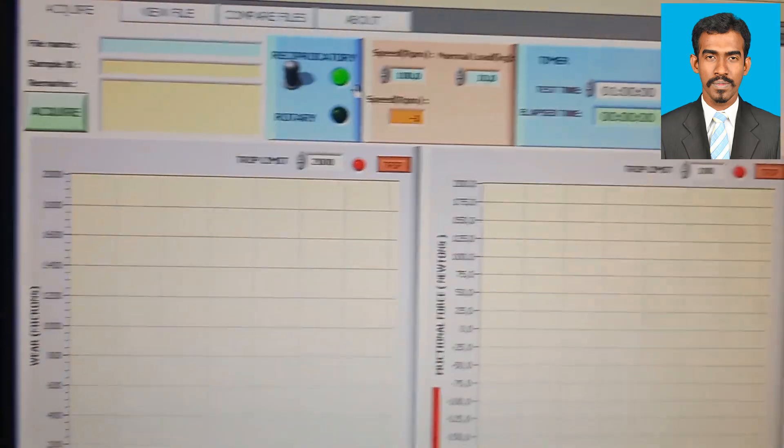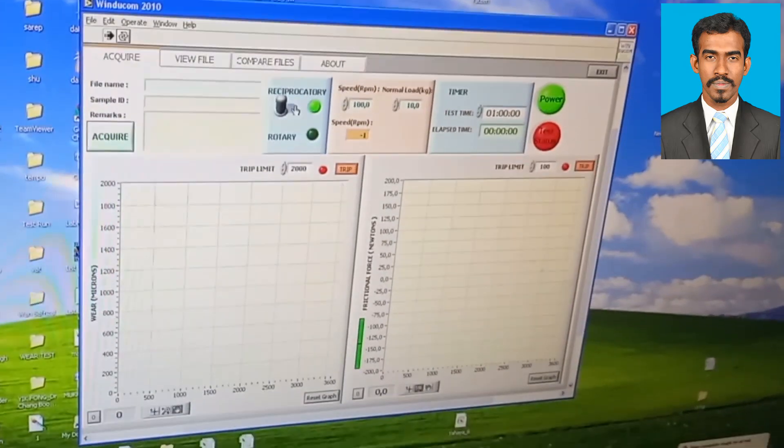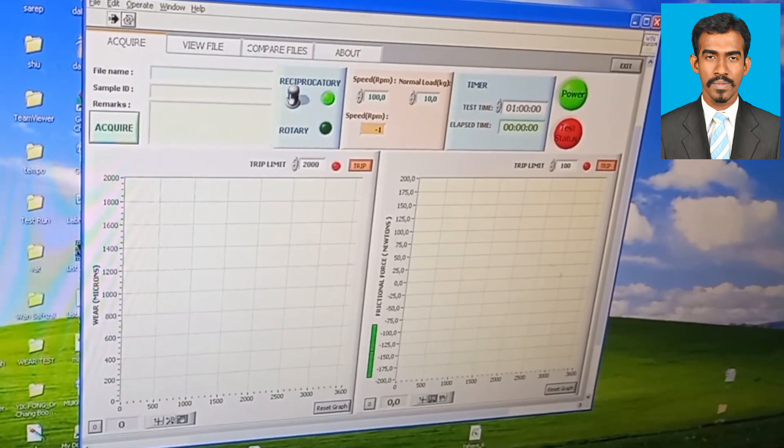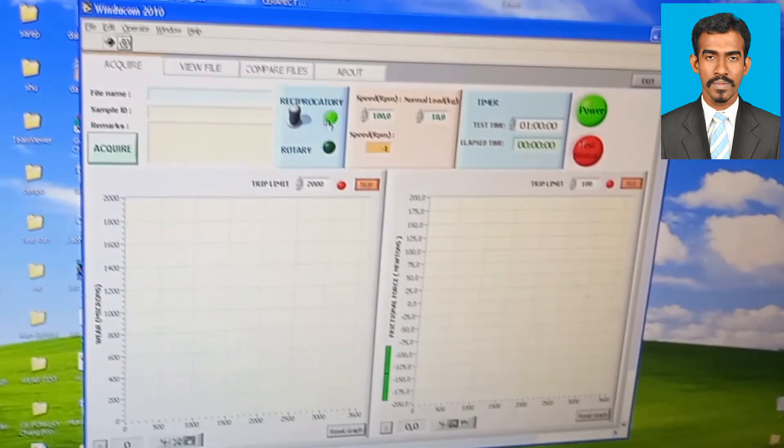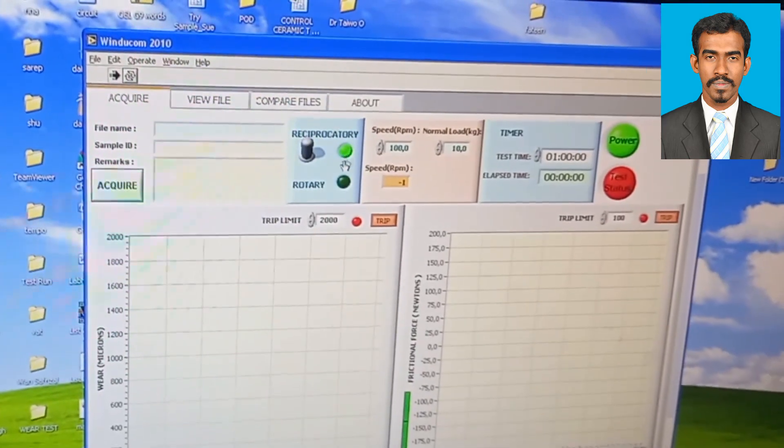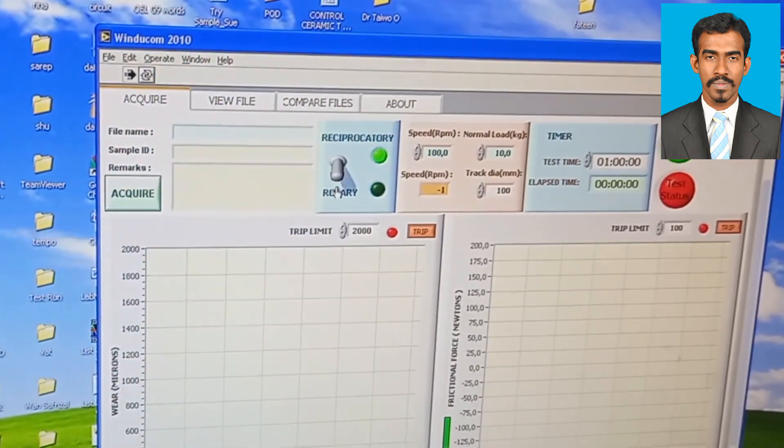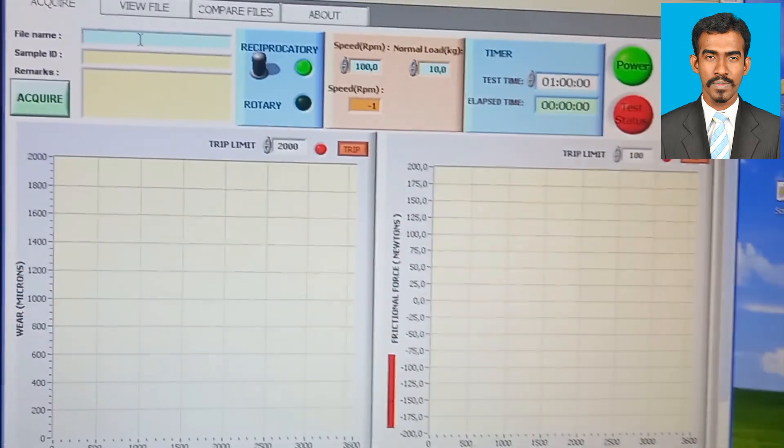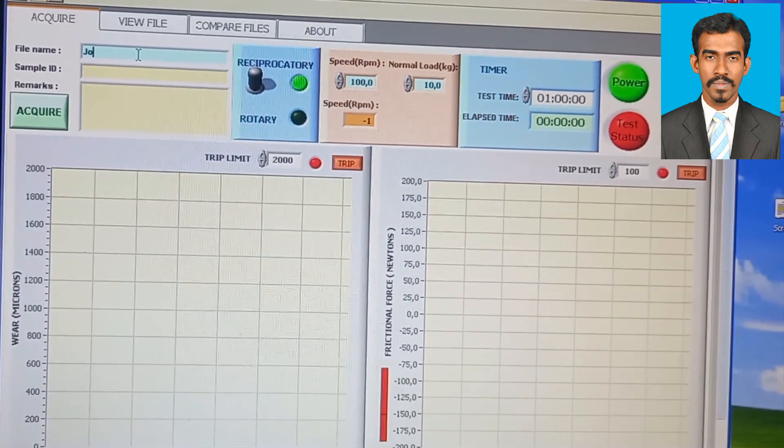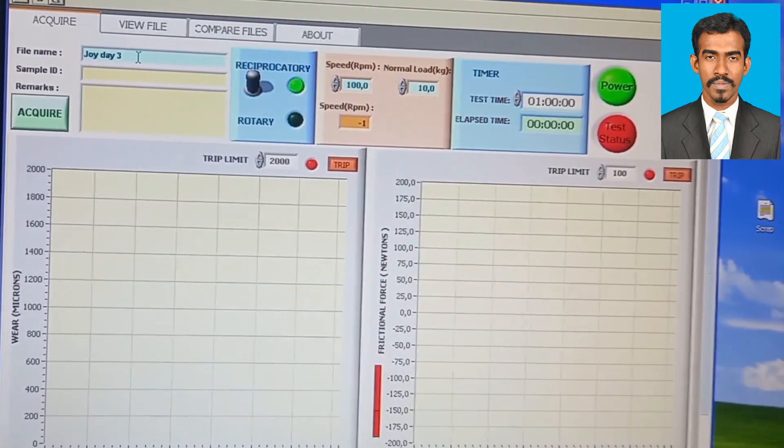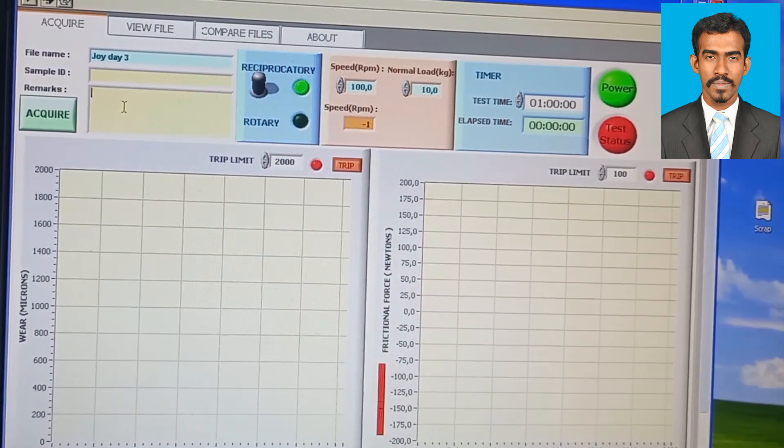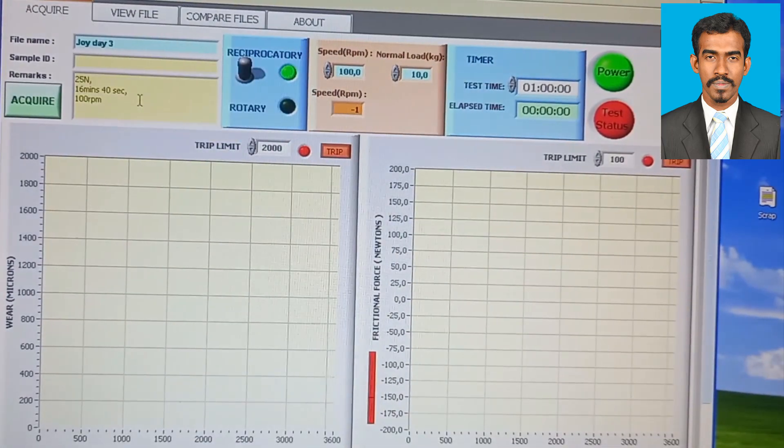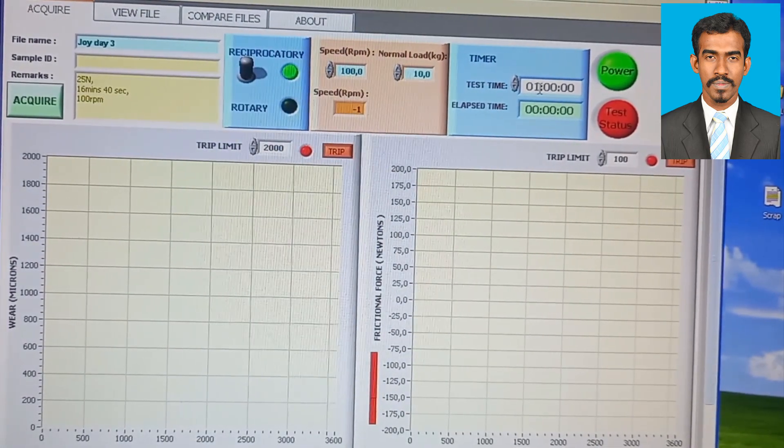The software name is Winducom. We'll open the software. Here my experiment is reciprocating, but we can also set it for rotating. There's a knob here - if we press this light it will move for rotary motion. Whichever motion we need, we can select that one. We'll give a name and can give some remarks. We can enter our parameters such as the load, the RPM, the time.